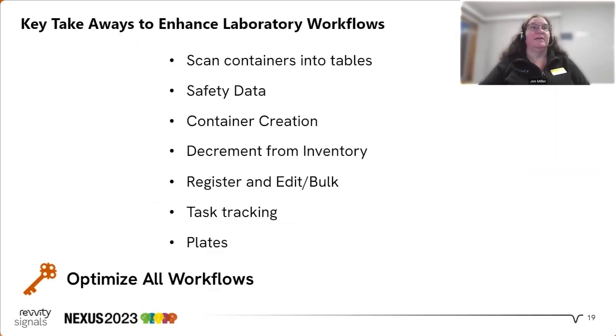I know we only have a limited time together, and I quickly spoke about the highlights, but my hope is that you see how focused we've been on integrating the material libraries and the inventory process into the everyday workflow of a scientist. For a real quick recap, users can scan containers into a table to save time and have the data populate for them, see safety data in the tables of their experiments, create containers, decrement directly to keep inventory up to date while at the same time automatically having a check-in, check-out, update status, experiment reminders built in, register, bulk edit, and upload from CSV material library information to keep a clean and up-to-date registration system.